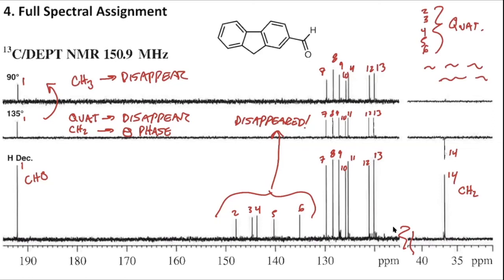So now that we've looked at the one-dimensional data, we can start to move on to the two-dimensional data. Again, I'm going to do this in a manner where I just go through all the data and see what there is, but I'm not going to try to really label anything too strongly just yet until we have all of the pieces to look at together.